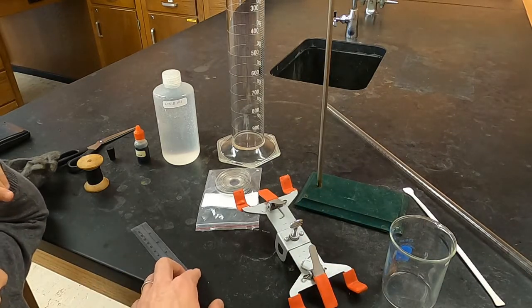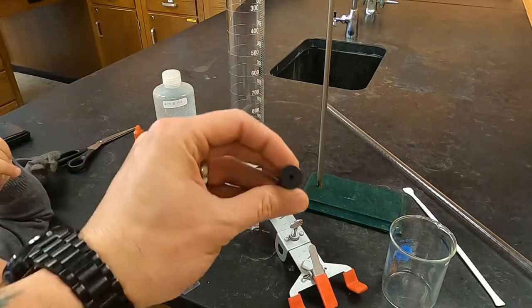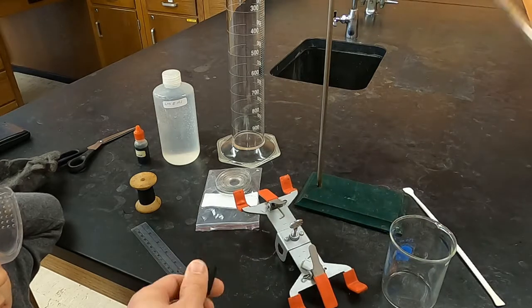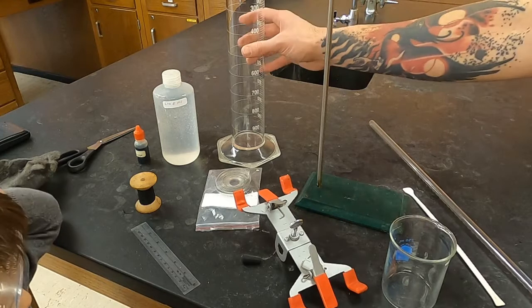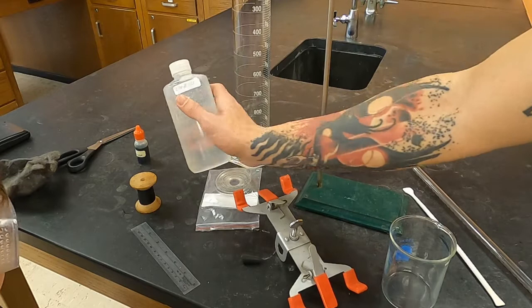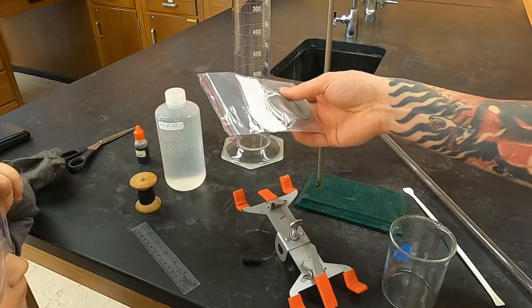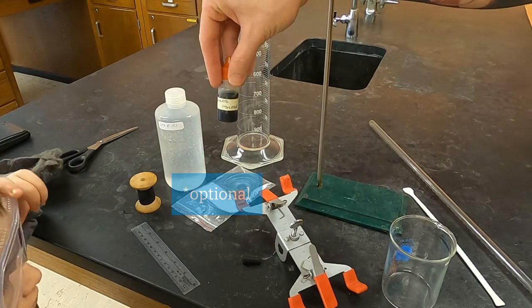You'll need to use a ruler and some string. You'll need a stopper that's size double zero because it needs to fit in the end of the eudiometer. At the main sink there's going to be a large graduated cylinder. For reagents today you're going to be using hydrochloric acid at 6 molar concentration, some magnesium metal, and universal indicator is optional.